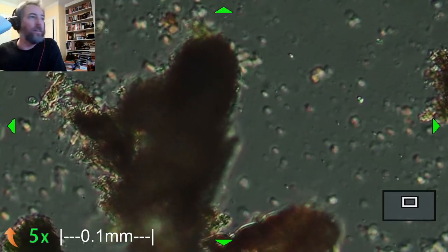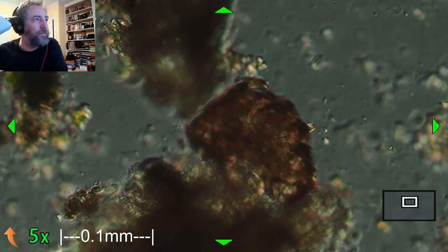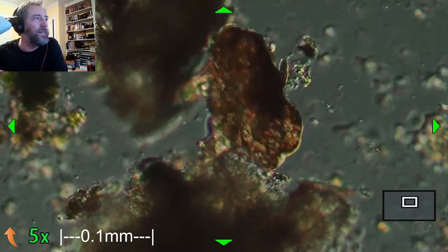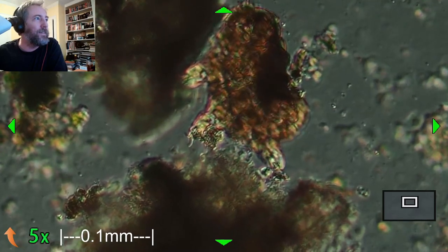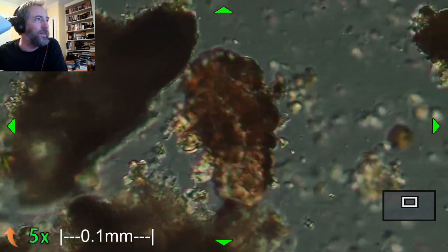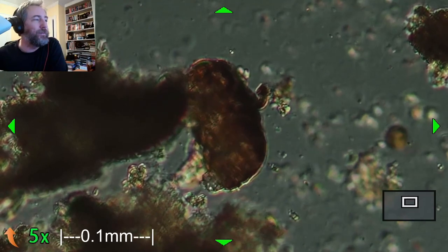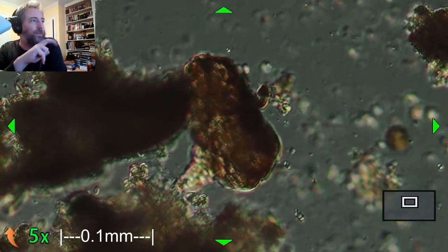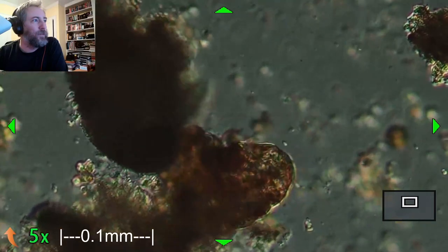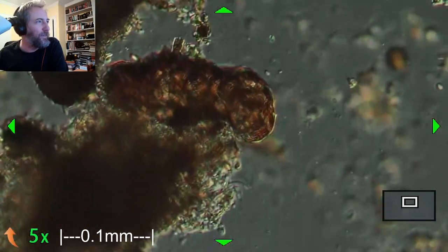There you go, you can see. Oops. If I would get it back into the field of view, you could see it. Water bears have 8 legs. If you're a regular in the channel, you'd know that for sure. And the two back legs are sort of grasping legs. This one's kind of a mess. It's got its whole body kind of scrunched up. The front 6 legs are sort of independent from each other, but the back 2 legs are a little bit like a scallop or something. They're sort of pointed or hinged backwards. And they mostly use them for grasping things while they search around, bumble around, you might say.